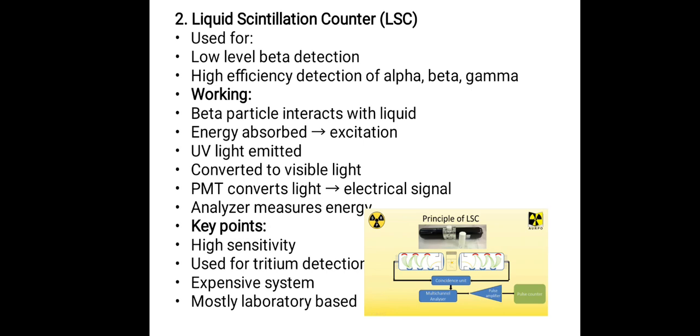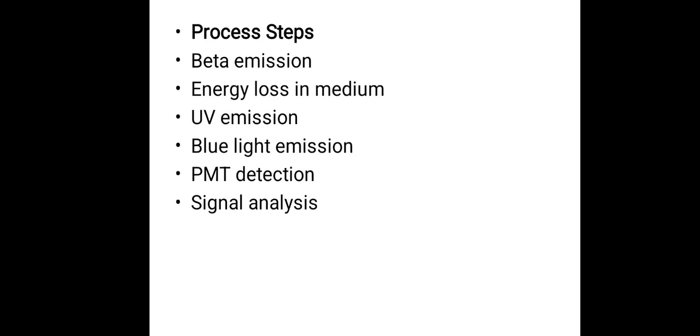Key points: high sensitivity, expensive system, mostly laboratory use. Process steps: beta emission, energy loss in medium, UV emission, blue light emission, PMT detection, signal analysis.